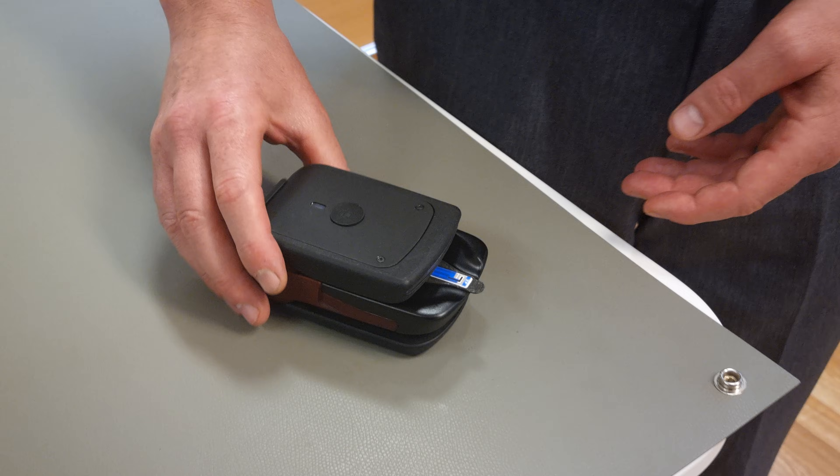Let me just do a quick summary. This is the Sensi All platform. It's designed for people who have an idea and want to get to product really quickly. This has weight, so it feels like a really quality product. It's got LEDs that will tell you it's powered, and LEDs that tell you that the method file is running.